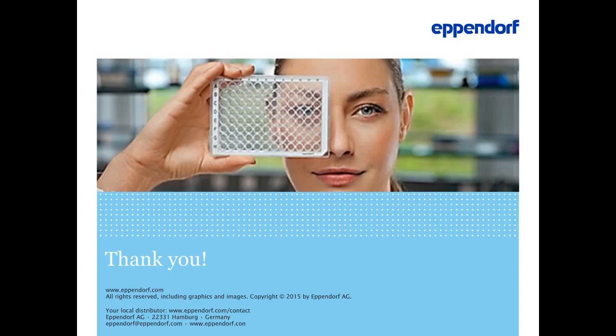Okay, here's another one for you. What about the effect of leachables on long-term storage conditions? Most of this data is regarding short-term effects, but I might imagine the time factor plays a huge role here, and the longer the time, the more leachables you have. And in most cases, the temperature also plays a role, so it's kind of tricky to predict. In my opinion, there is just one paper regarding this so far. Generally speaking, we don't have much data on long-term storage, so it's still under evaluation, and I think scientific papers will be coming on this.